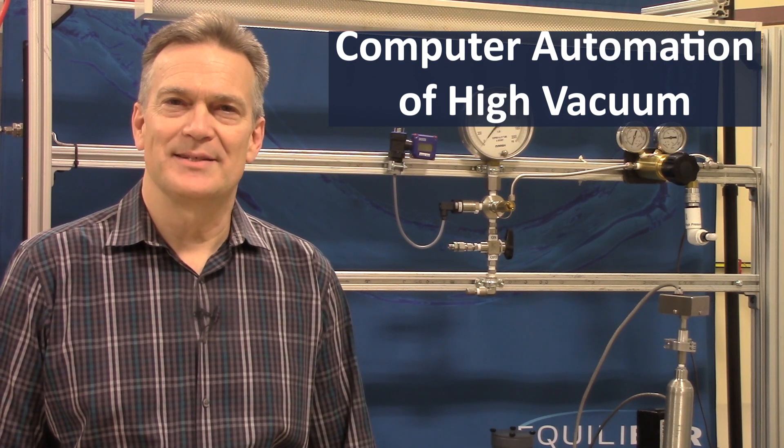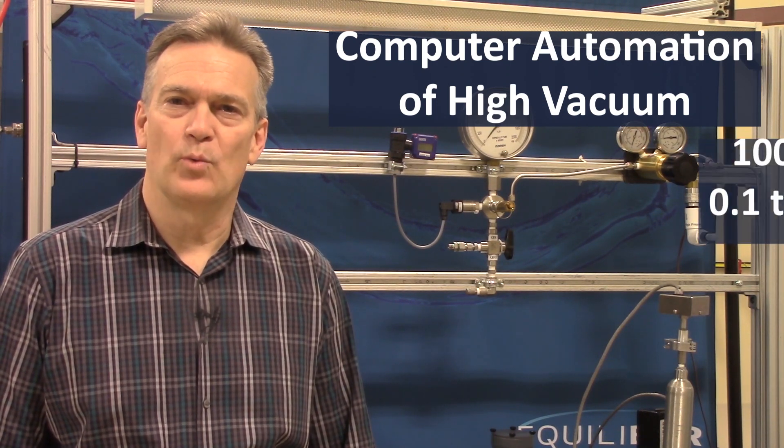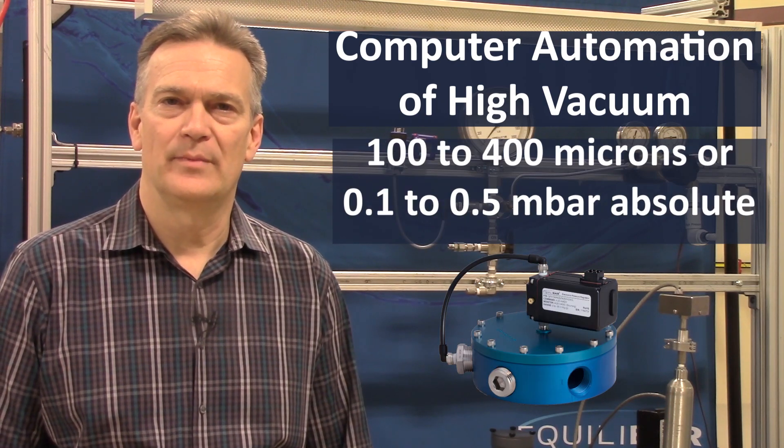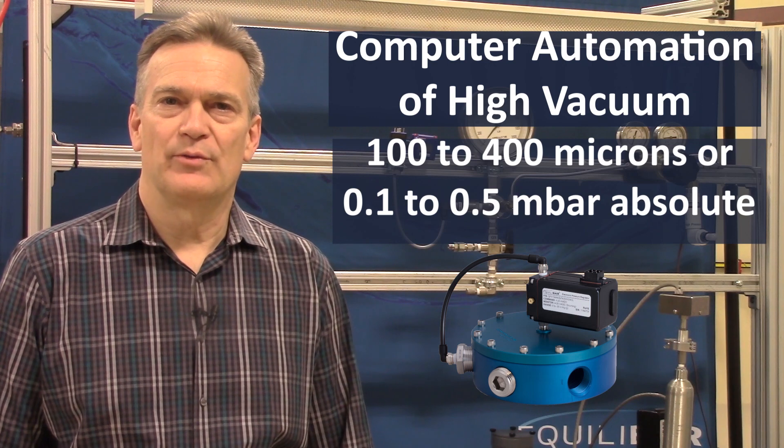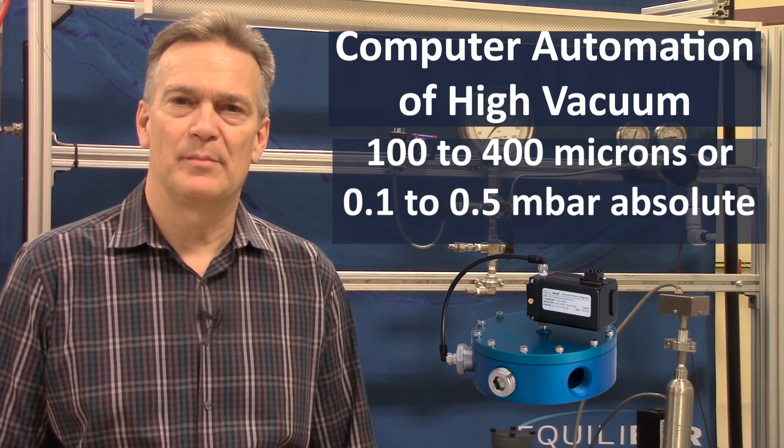Hi, my name is Jeff Jennings. This video will demonstrate computer automation of high vacuum in the range of 100 to 400 micron using an Aquilibar vacuum regulator. This type of system is useful for chemical processes such as vacuum distillation or analytical applications.